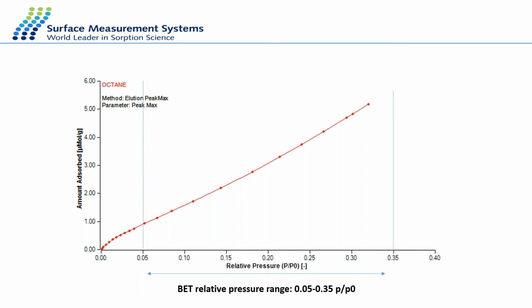If you start with the highest available concentration, after the first injection you can modify your method. You can stop or edit the method based on that first injection. That's why I just start with the highest, so I can modify after the first injection. Yeah, sorry. Okay, thank you.